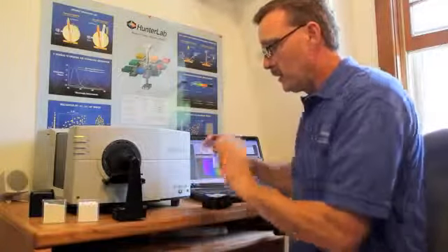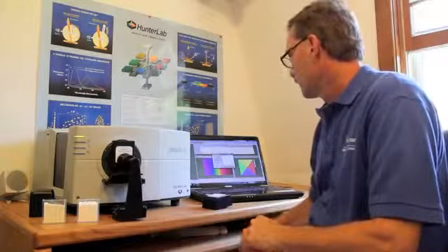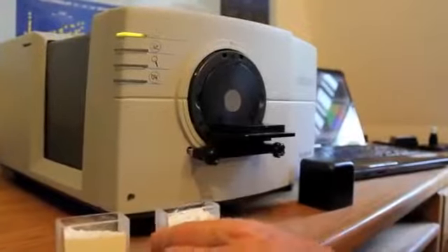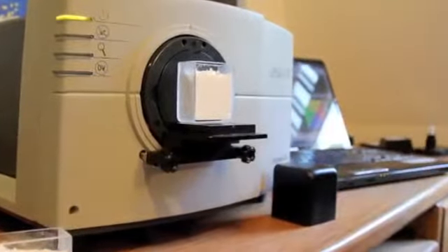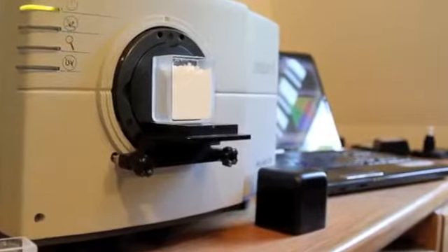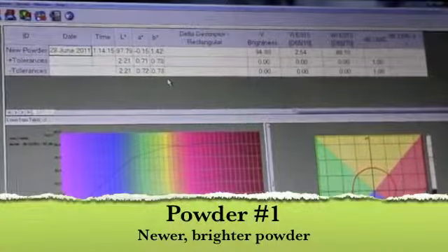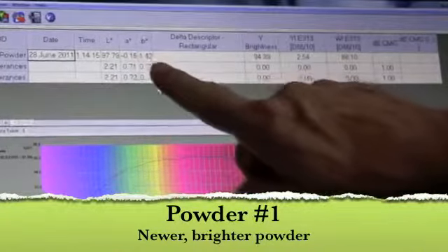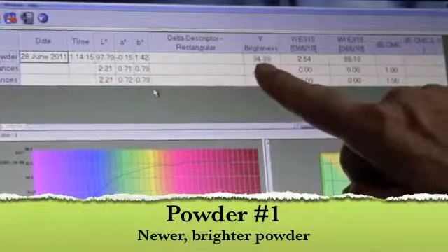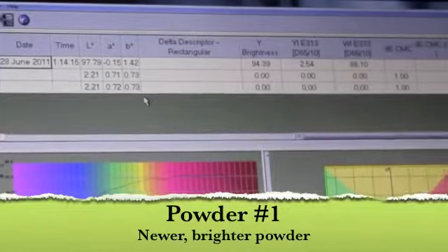We'll measure our first sample, which is a nice bright powder, and define this as our standard. With our first reading, we have a nice bright product with very little color. The A and B value is close to zero, a nice bright product with a value of 94, a yellowness index of just two, and a whiteness index of 88.